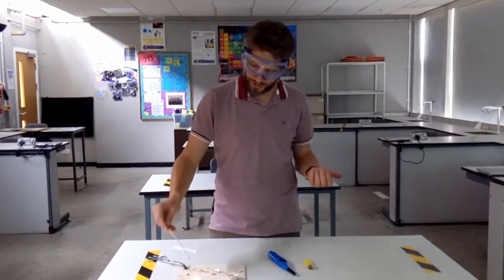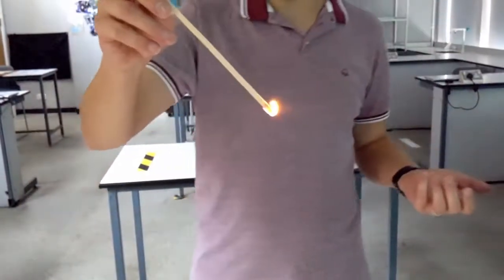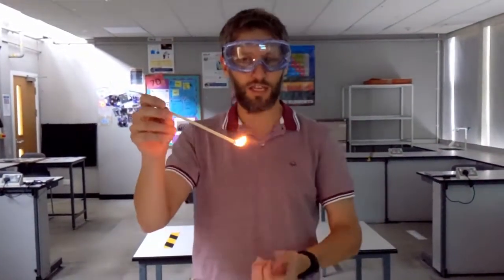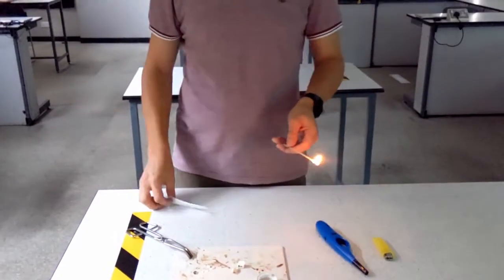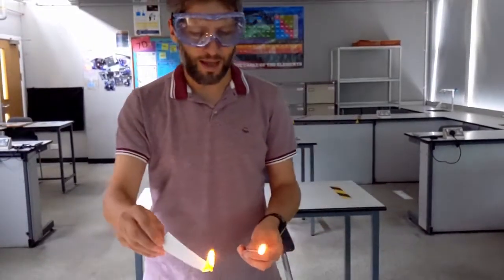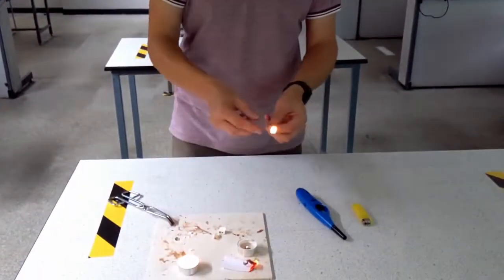So I've got a candle already burning, but wood is something that combusts very easily. So our little wooden splints, they will burn very easily. That's effectively combusting, and we're producing carbon dioxide and water here. Other things that you'll be aware of that will burn very easily is simply a bit of paper. Again, the paper is a fuel and it burns very easily, producing carbon dioxide and water.